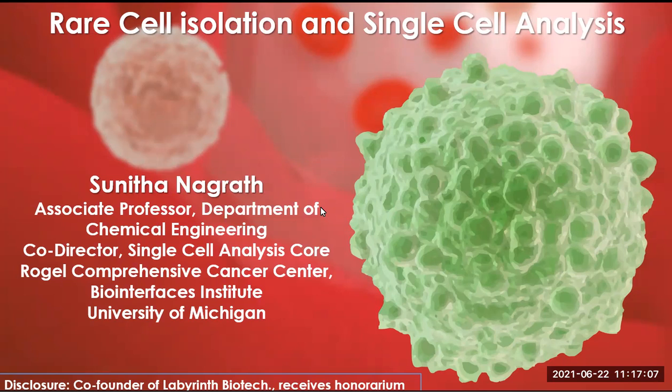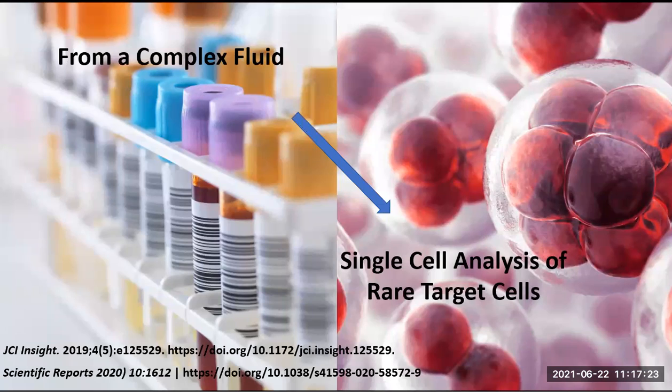I'm an associate professor in the Department of Chemical Engineering, and I'm also one of the PIs on the spatial analysis program. Today, I'm going to talk about rare cell isolation and single cell analysis. Most of the time when we talk about single cell analysis, we are trying to identify the heterogeneity in bulk cell populations that are more abundant.